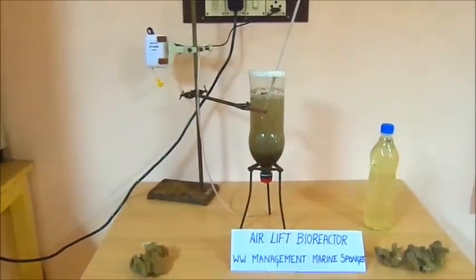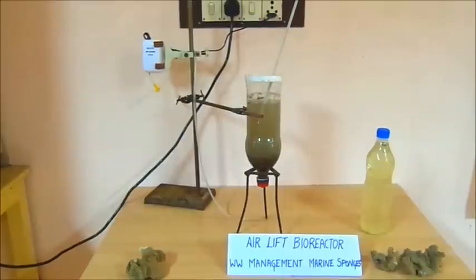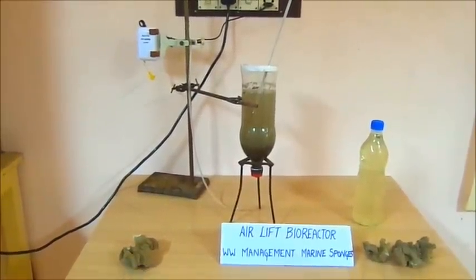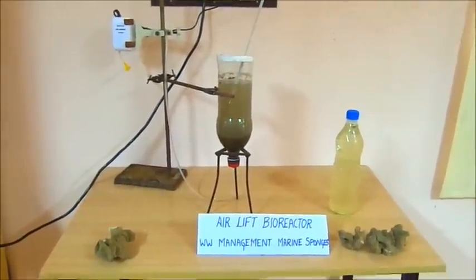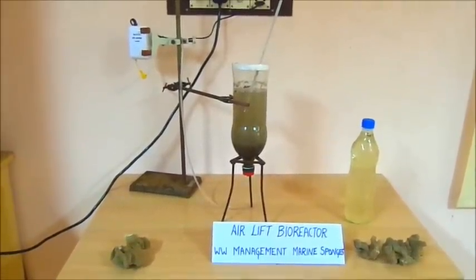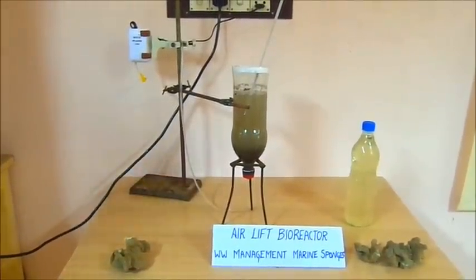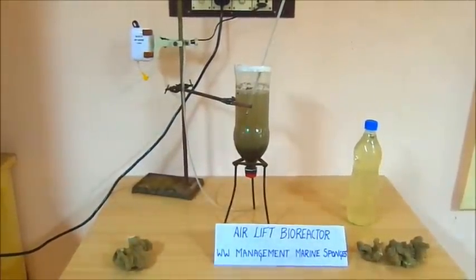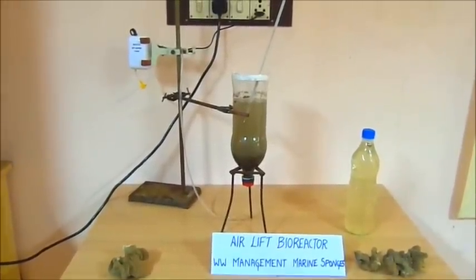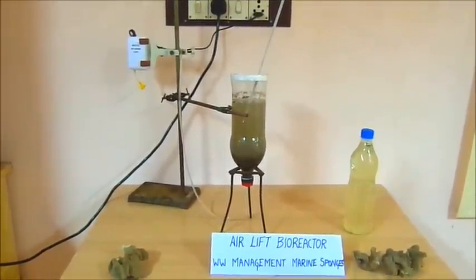This is a lab scale model of a fermenter that is used for waste water management. In this concept we are using an adsorbent — marine sponges — for absorbing all the impurities present in the local waste water. The waste water is collected from hostels of colleges, hospitals and from our homes. This waste water contains microbes, salts and other salt impurities. Sponges are intended to adsorb these solid particles and make the waste water suitable for plants.